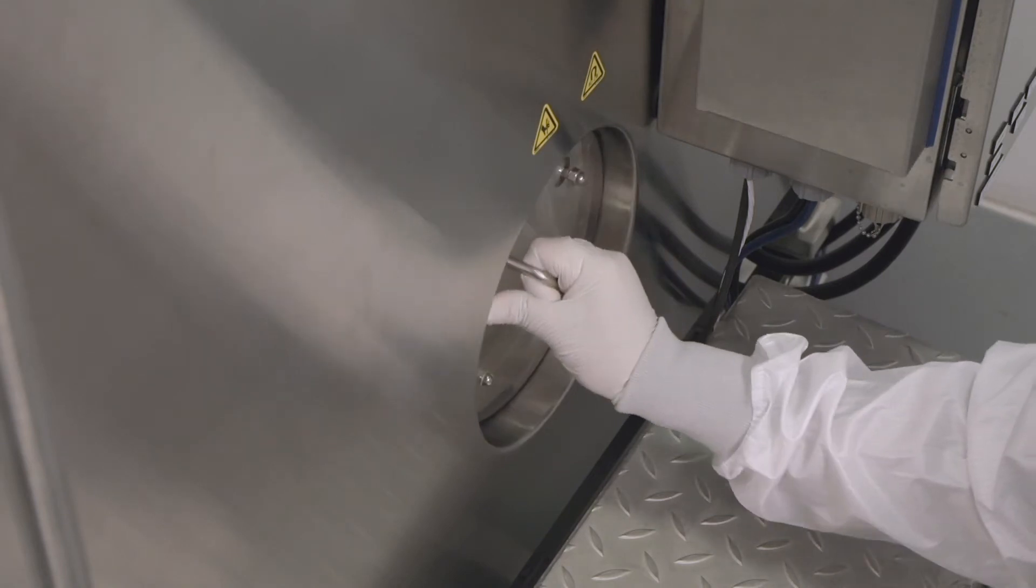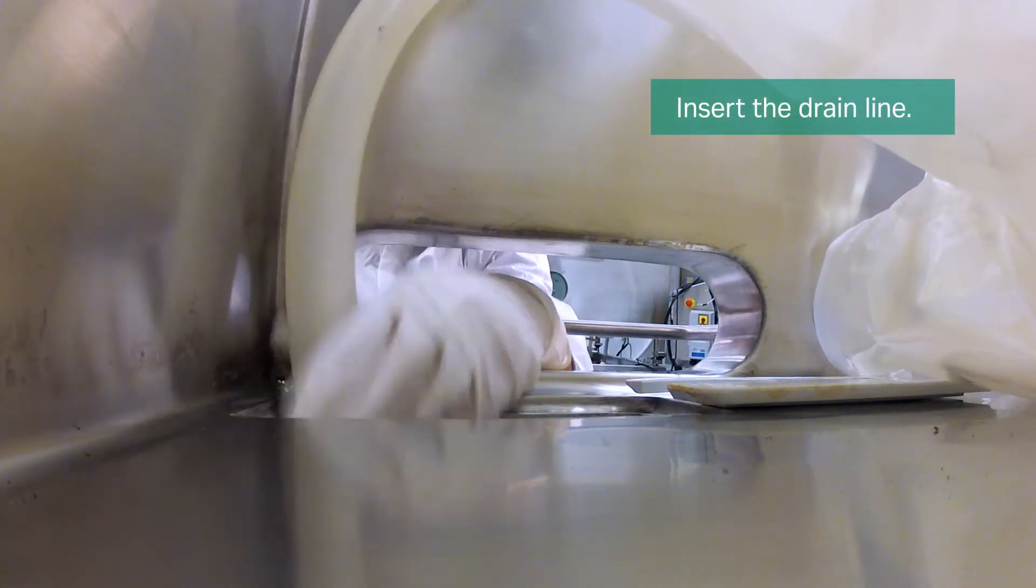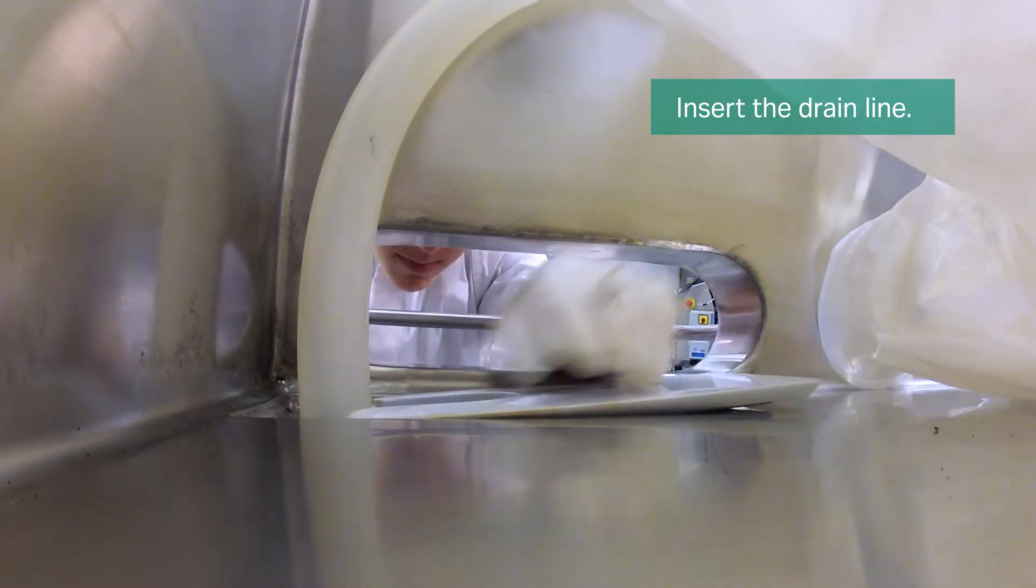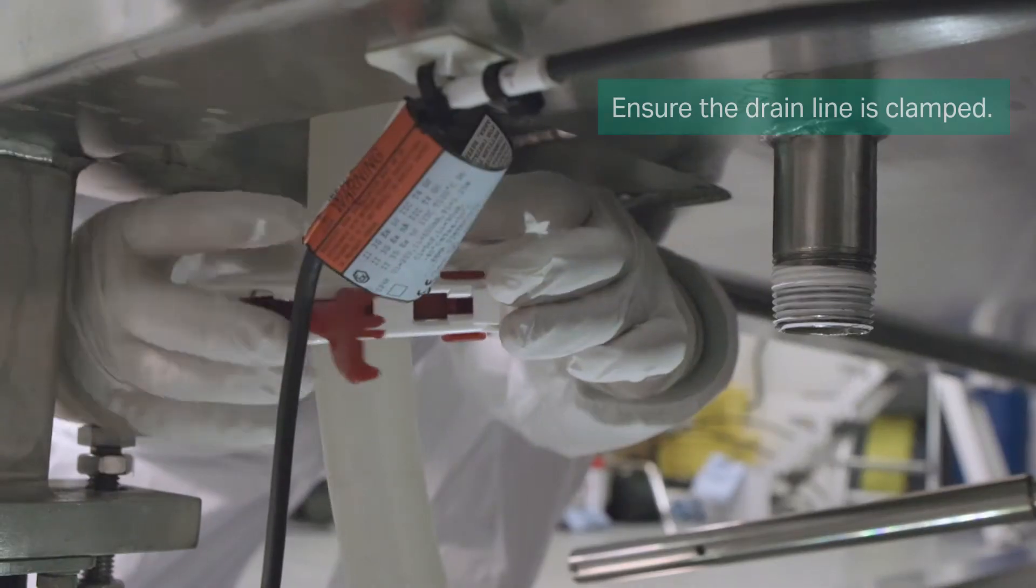Reinstall the access doors. Insert the drain line by carefully pulling the line through the drain opening and ensure the line is clamped.